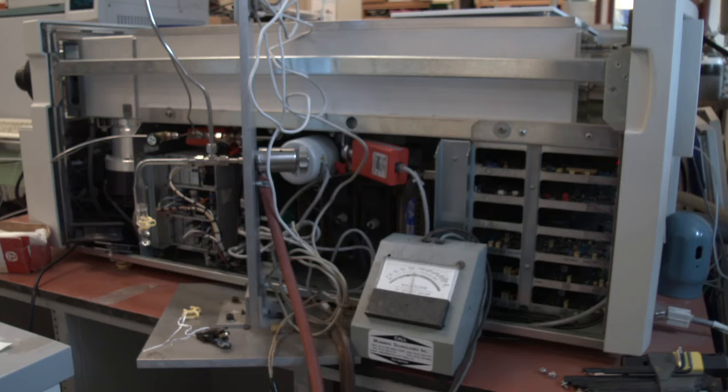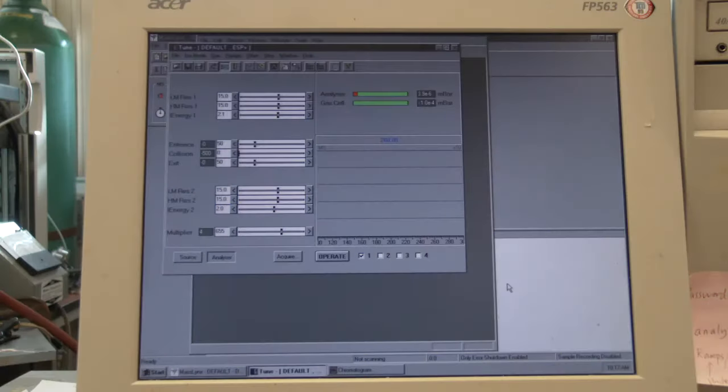In this Waters instrument there are two gauges, a Pirani and a Penning. The Pirani is located in the middle quadrupole, the gas cell, and shows a pressure less than 10 to the minus 4 millibar. This is illustrated in words and color. Green means good vacuum, red bad. Argon gas is added to the gas cell during an MS-MS experiment, raising the pressure to above 10 to the minus 3 millibar. It is important to know the pressure in this region for that purpose.